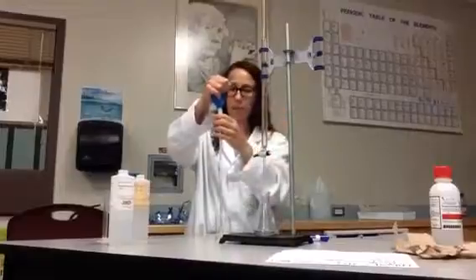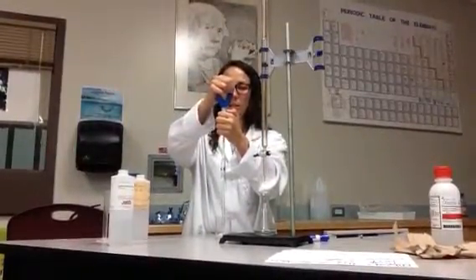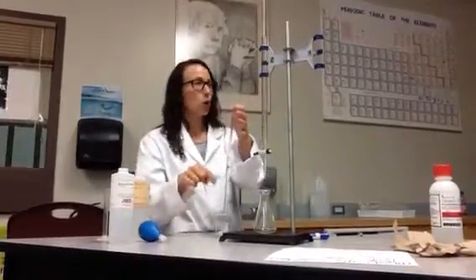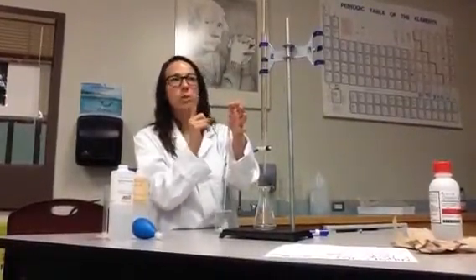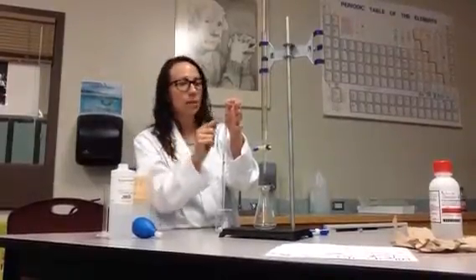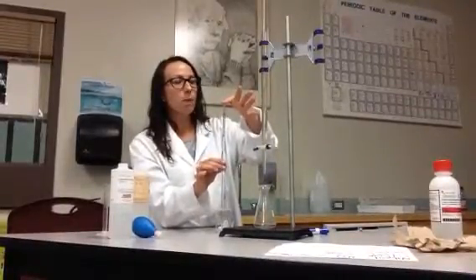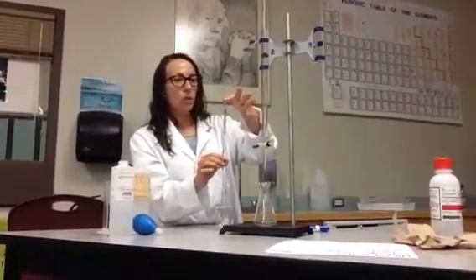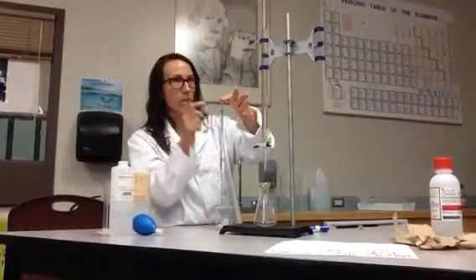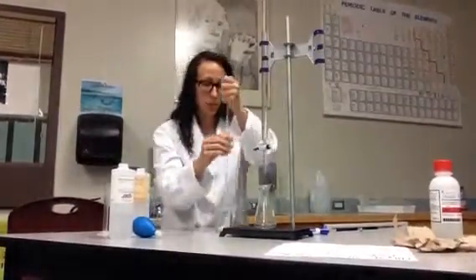So I'm going to suck it up. Pretend I've rinsed my 3 times. I'm going to suck it up until I get to the meniscus. Now I want to go just past the meniscus a little bit. I've got it quite firm on the bottom, and I've got my thumb on quite firm. What I'm going to do is release the seal a little bit to allow some of it to drop, but I'm going to do that by rolling it. Can you see it's going down just ever so slightly? The more I let my thumb off of the pressure, the faster it'll go. So if I roll, I'm just breaking the seal between the straw, the pipette, and my thumb, and I can eventually get exactly 10 mils by going to the meniscus.